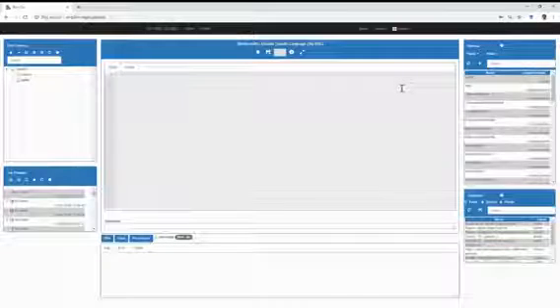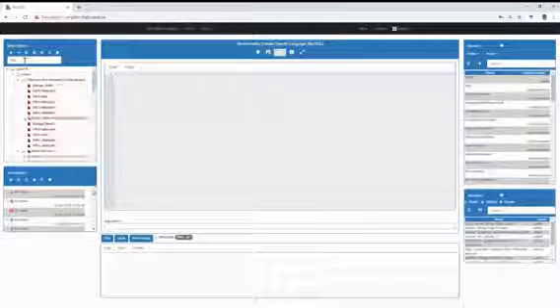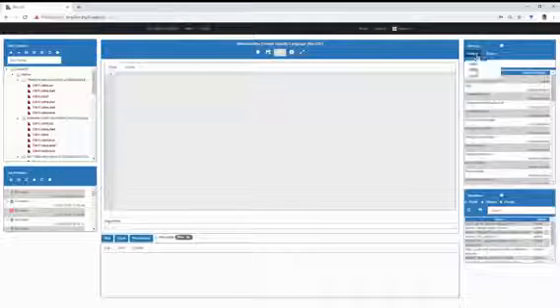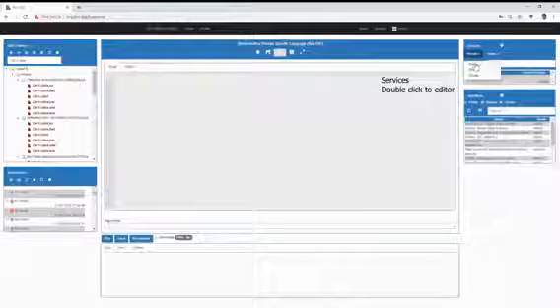Let's look at the data sources panel first. This is the left top panel of the user interface. It lists all the data items available from different file systems such as POSIX, Galaxy, and HDFS. The public folder of each file system is available to all users for read access. Another folder, named as username, is available for read-write accesses. The generated files during the workflow execution are usually found in this folder.